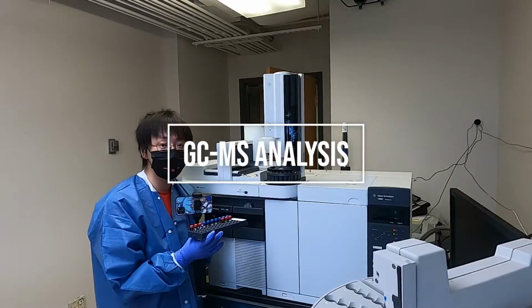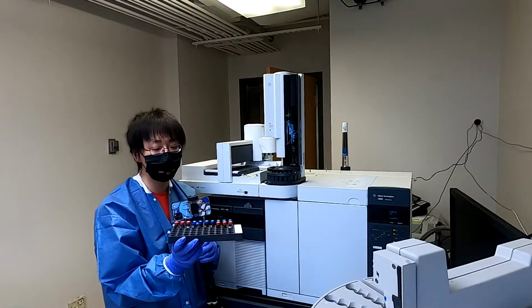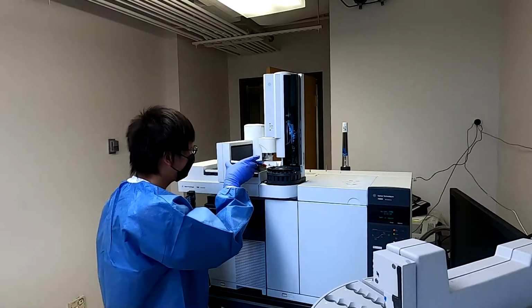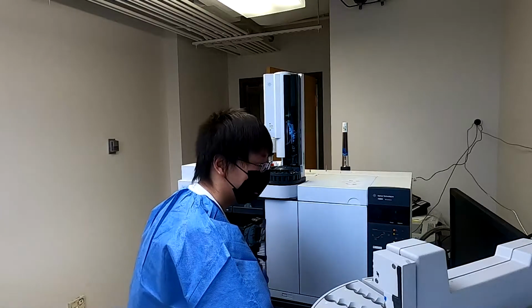So this is the GCMS, and we can see that the noise is very large in this room. So I'm going to put this rack into the GC. And then I'm going to use the computer to add the sequence.